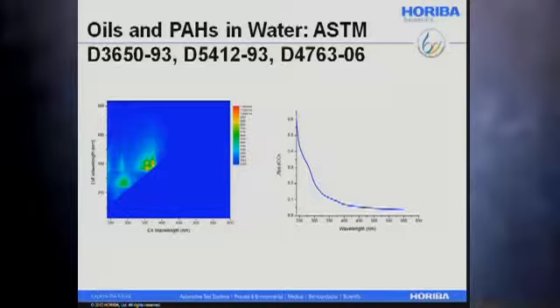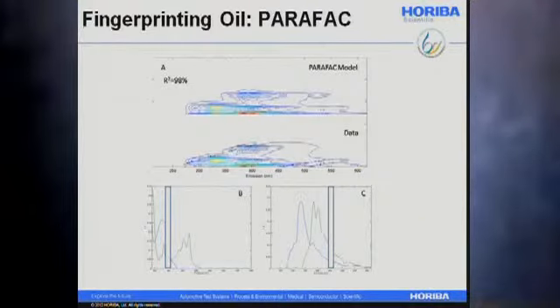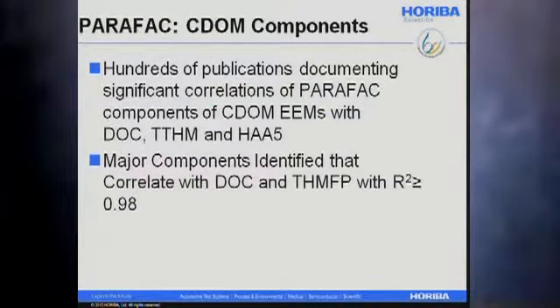So you have the absorption and the fluorescence emission data. This is an applied parafac model that shows the crude organic fraction here in blue compared to the polycyclic aromatic hydrocarbon. You see the very distinct finger-like anthracene structure here separates very nicely, so you can continuously look for polycyclic aromatic hydrocarbons in the samples in addition to the disinfection byproduct formation.